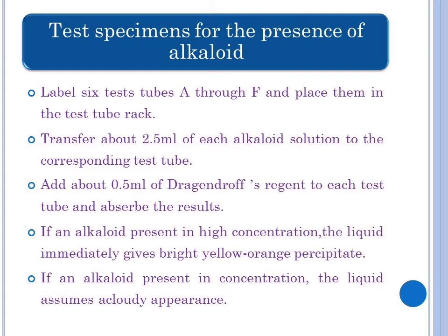Choose 2 or 3 of your own alkaloid solutions. Transfer 3 drops of each solution to the same well on the spot plate. Use the tip of a clean toothpick to mix the solutions. Spot the extra chromatography strip with a solution of mixed alkaloids. Allow it to dry and then re-spot it a total of at least 5 times.